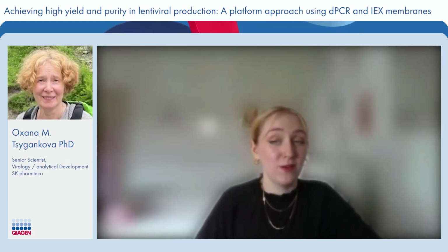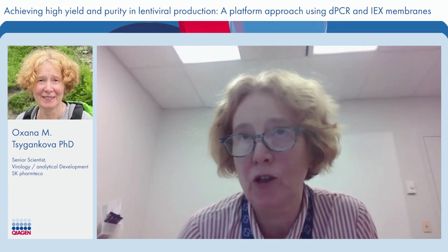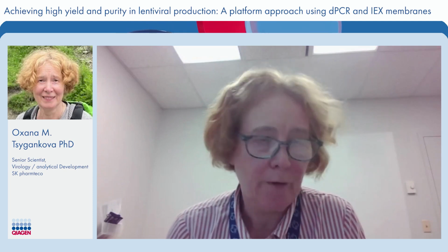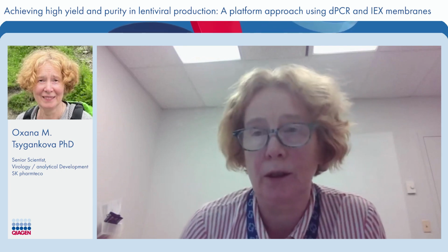And Oksana, we have another one for you. What samples can you test for RCL presence? We can test practically all steps of manufacturing and production processes, and we offer tests for viral final products, end of production cells, and also vector supernatant.